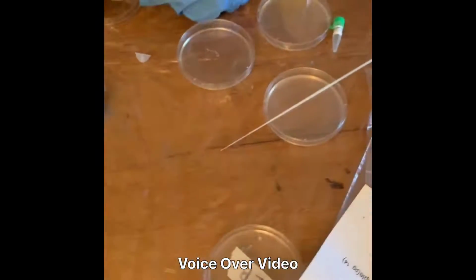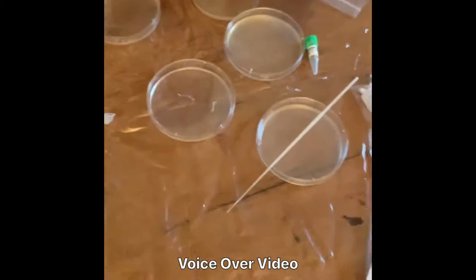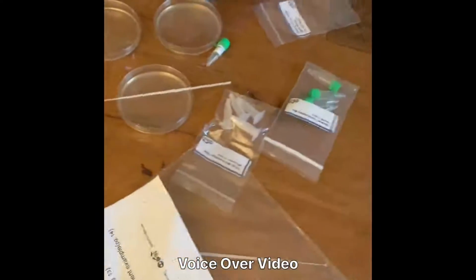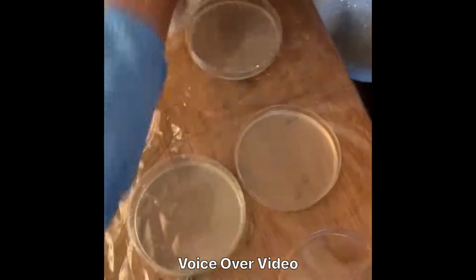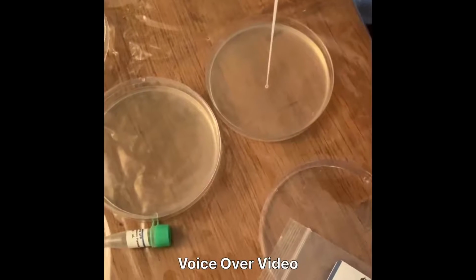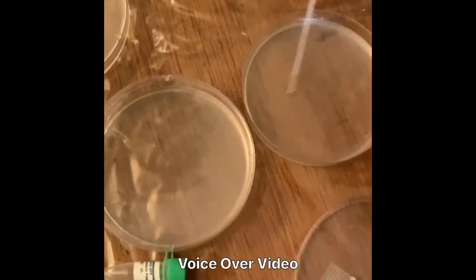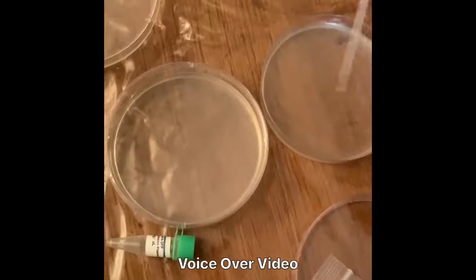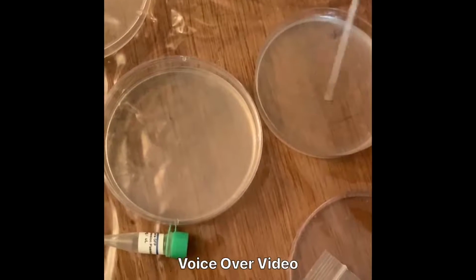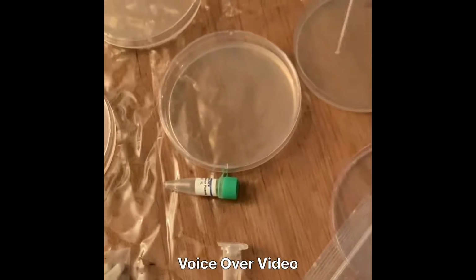Then I took this little loop again and I spread it across. I streak it across, right? Gently spread the bacteria around the plate. Just basically spreading bacteria.